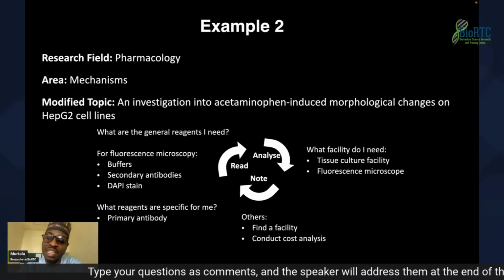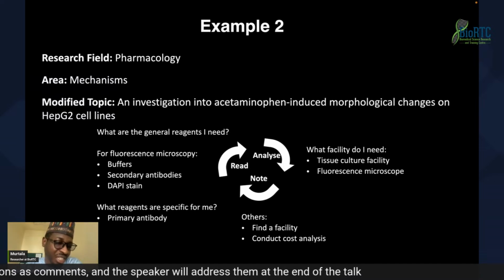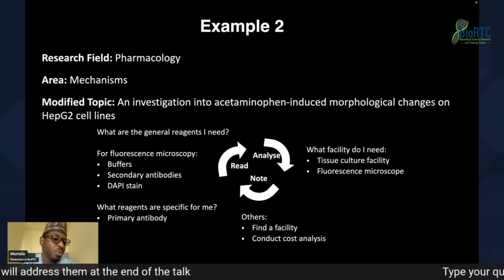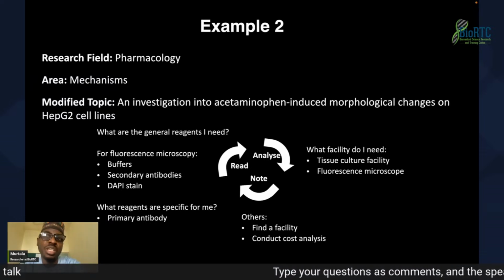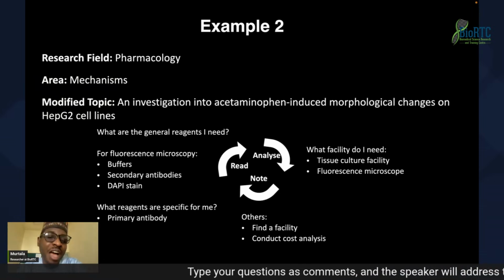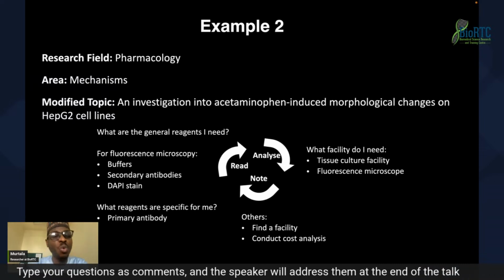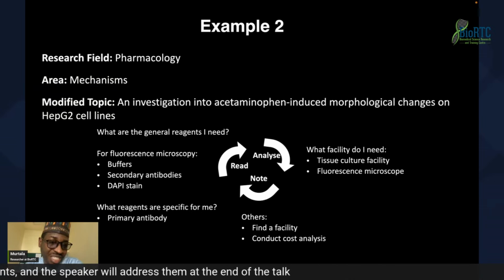They bind DNA and they release fluorescence light that you can detect using fluorescence microscopy. So don't, just because you've seen that somebody has published with DAPI and we tell you that no, we have Hoechst, just say, oh no, I need DAPI, and go and purchase DAPI, which is expensive. So you have to think about what alternative reagents are available when you are designing your work.